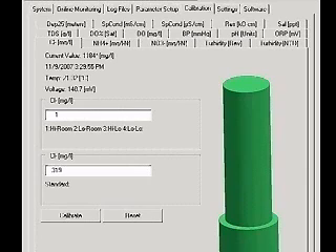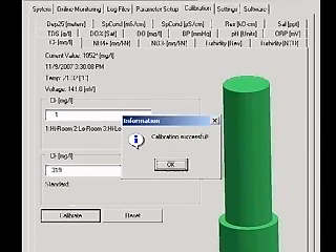When the readings are stable, type a value of 1 in the first box to designate the high standard. Type 319 into the second box and click Calibrate. A calibration successful message will appear. Record the temperature and voltage reading.